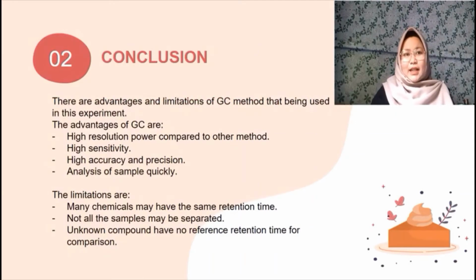In a nutshell, this experiment helped us to understand well about gas chromatography method. There are advantages and limitations of gas chromatography method. The advantages are it has high resolution power compared to the other method. It has high sensitivity. Also, it has high accuracy and precision. And lastly, it can save our time as the analysis of sample is very quick.